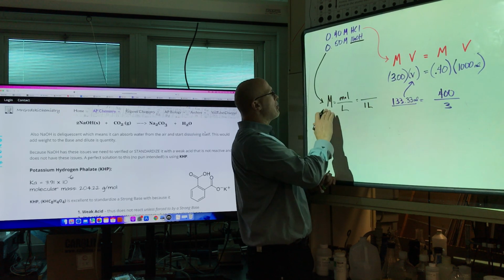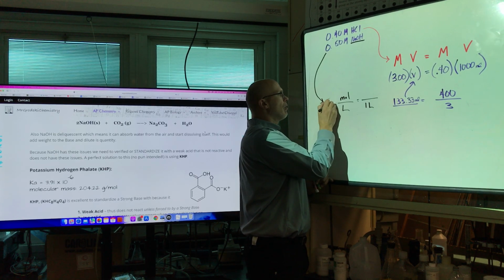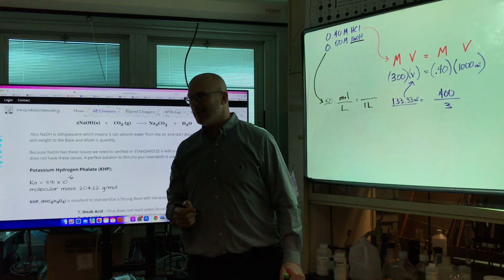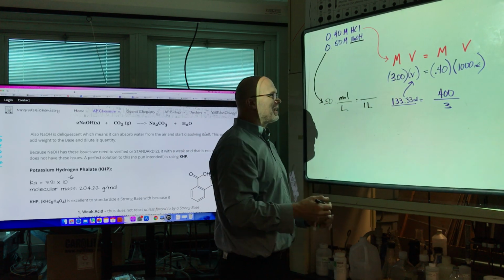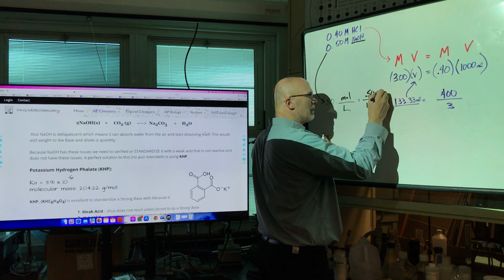Now, what's the molarity we want? Well, we want 0.50 molar. So can anyone solve for how many moles I need? It's over 1. Okay? 0.5. Okay, so 0.50 moles we'll need.